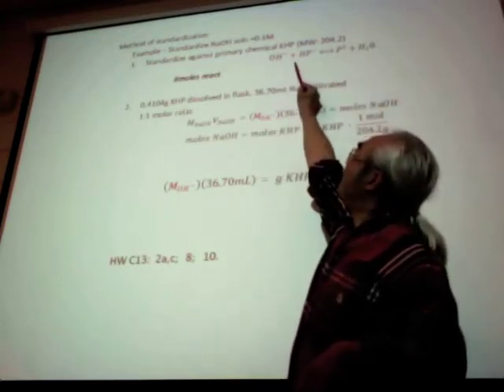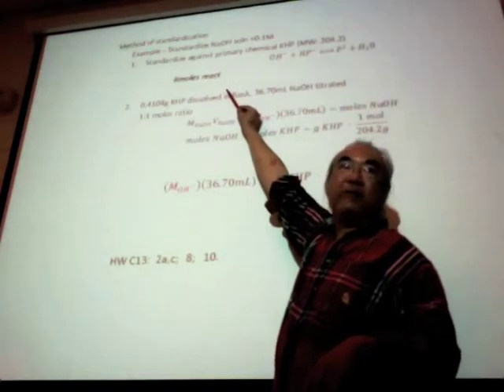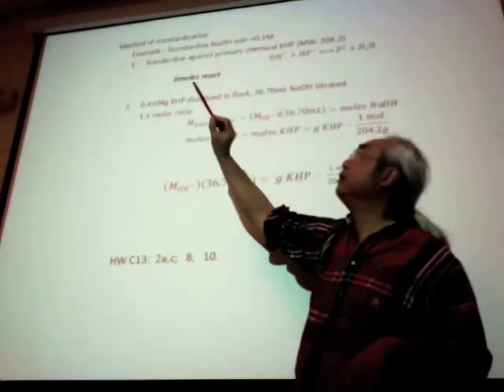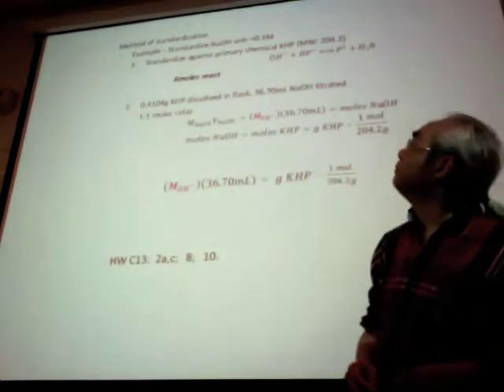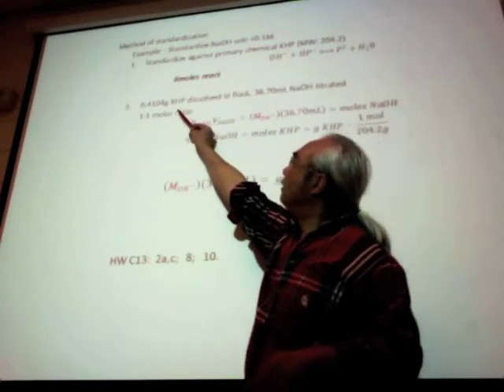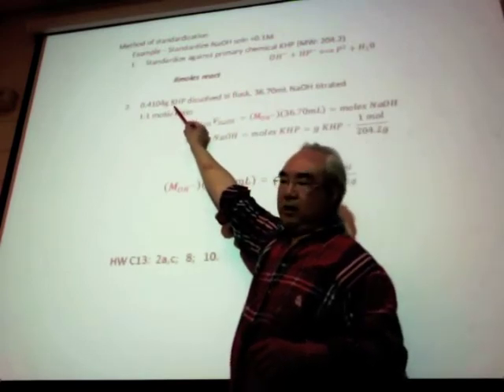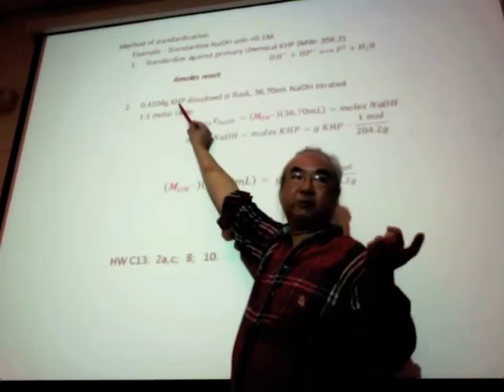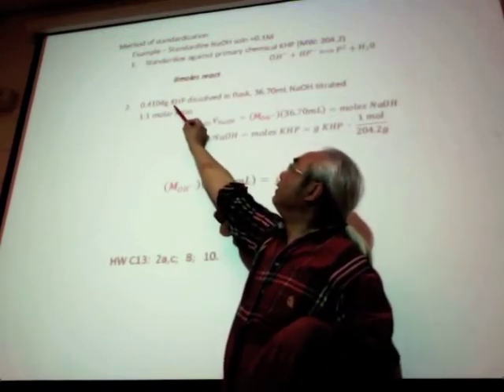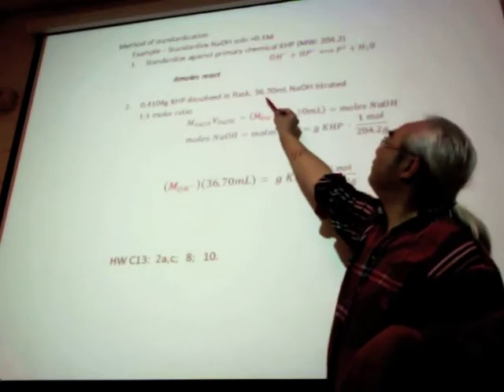The number of moles that have reacted will relate to each other based on the number of moles. As an example, this is going to be very similar to today's experiment. You weigh by difference, then dissolve.